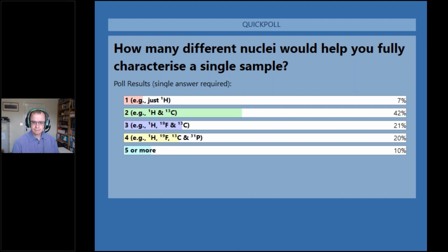It's very much an indication that a lot of chemical characterization is limited to organic compounds, where you are pretty much looking at what I'm almost certain is going to be proton and carbon, but recognizing there are a fair number of other systems out there where you are looking at 3, 4, 5 or more. In my past life in academic research, I certainly, as a matter of course, was very much in the 5 or more category for virtually everything I worked with.